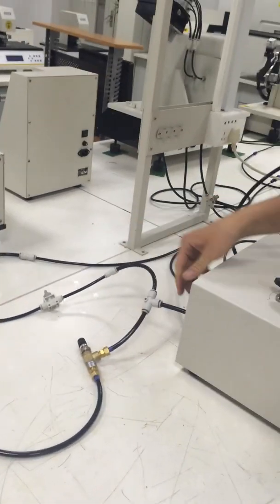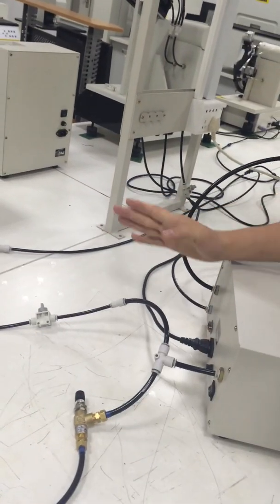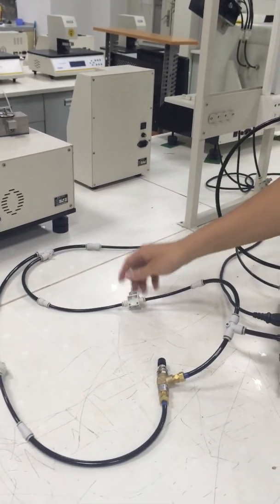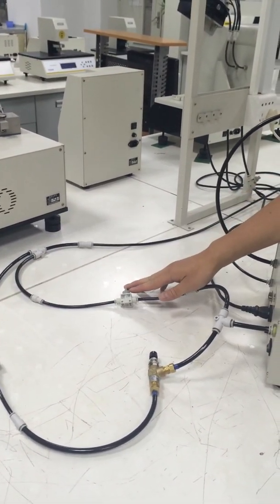You can see this is the gas inlet to the instrument. Now we divided it into two pipes. One is a normal pipe with only one stopper, used for burst test.